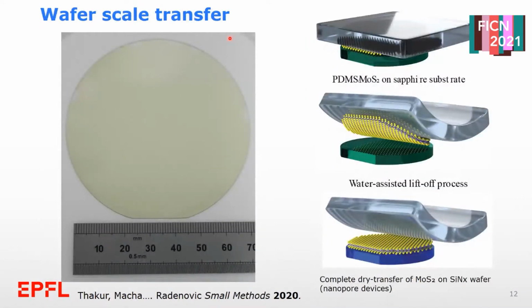Having developed this, it has become eminent that the rate-limiting step in production of our devices is the transfer. And for that, we have also developed a method that allows us to transfer not only one device by one device, but a whole wafer of the system.